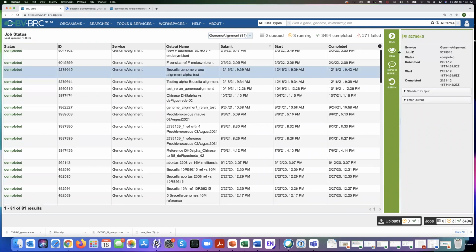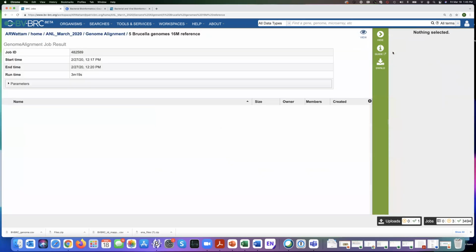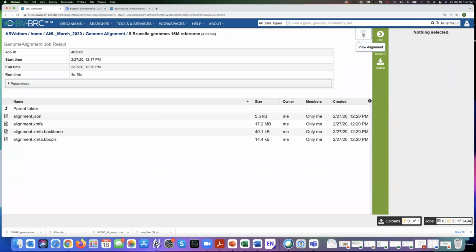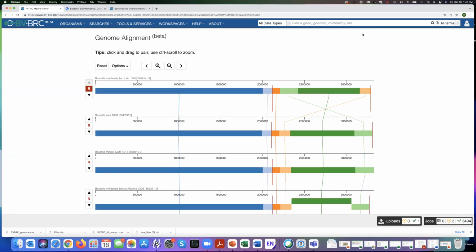How many genomes was it? There's some good ones, this one should be good, I hope, depending upon the reference that I did. Come on, Mauve. Okay, see how easy this would be? If I could see it was aligning and these were all contigs, it'd be dirt easy just for me to artificially align those things just in a text document. And I've done that before just to create it.